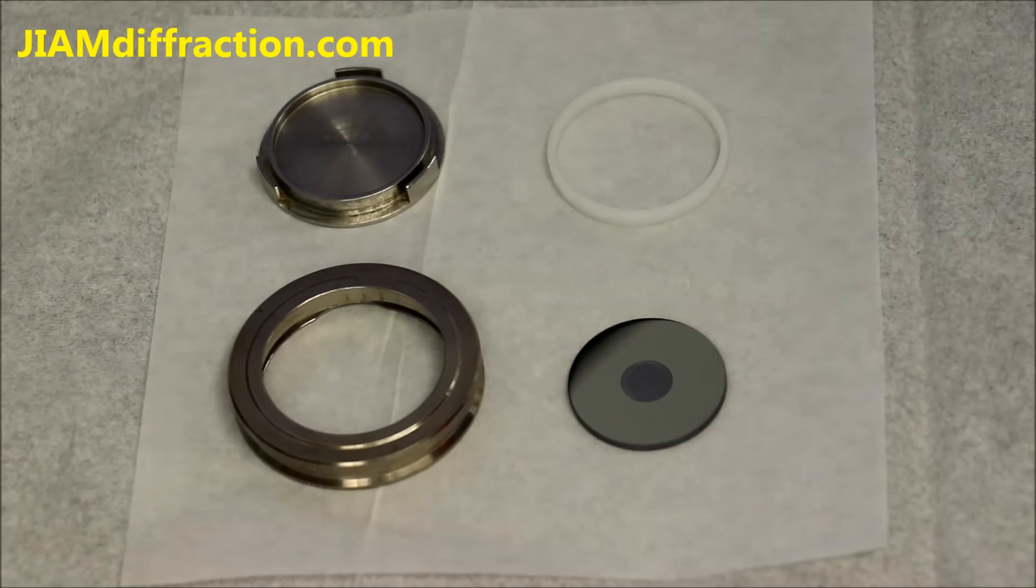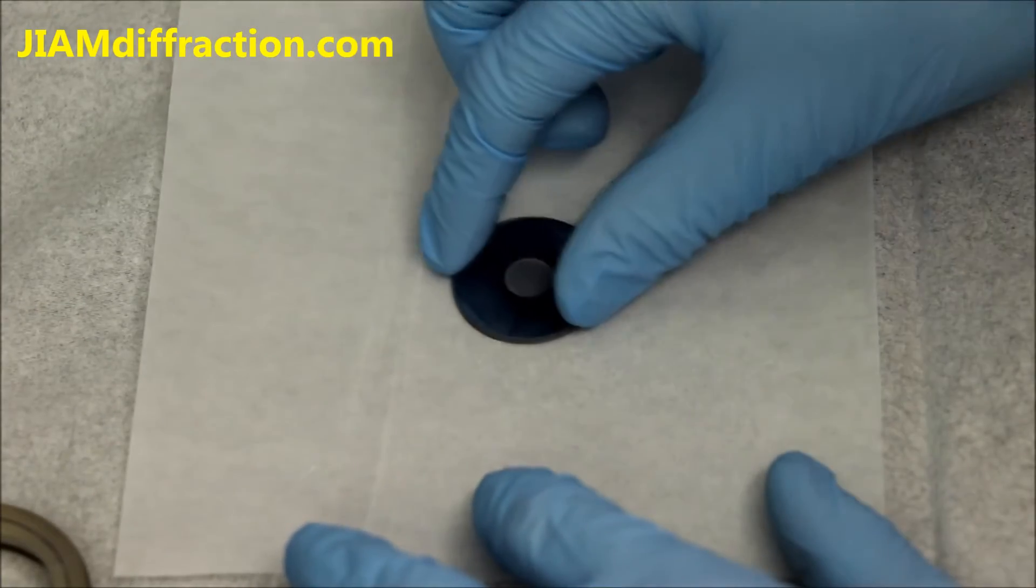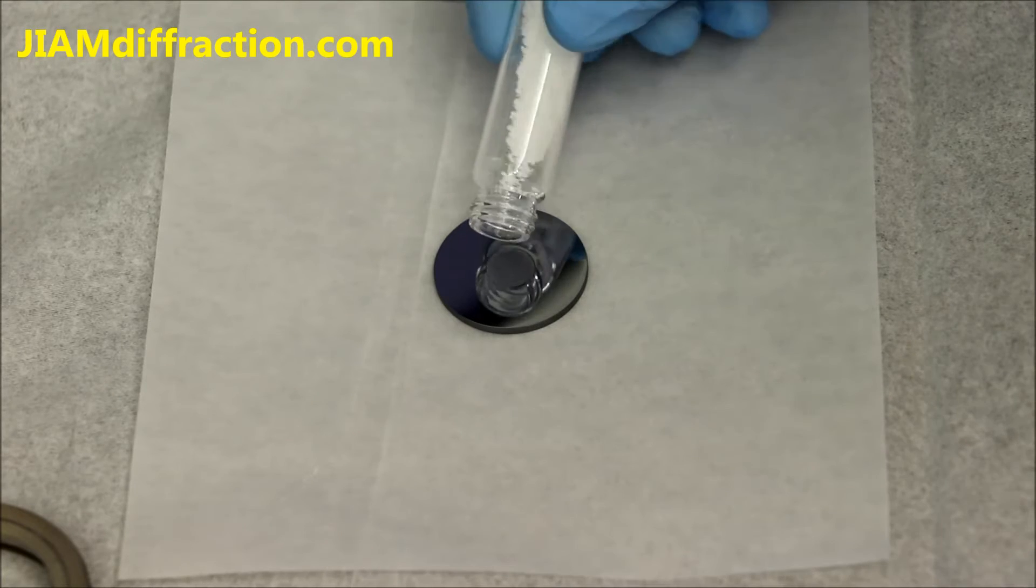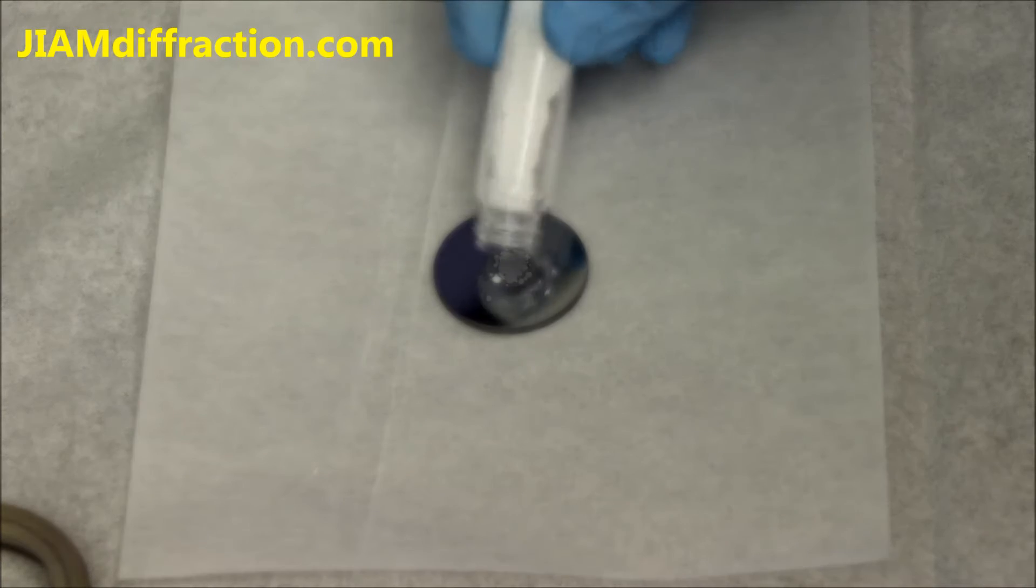So what we see here are the different parts to the sample holder. I'm going to move some of these out of the way and first prepare the powder in the sample holder. So I'll just apply a small amount of powder to it, it's a very shallow well so it doesn't take much.